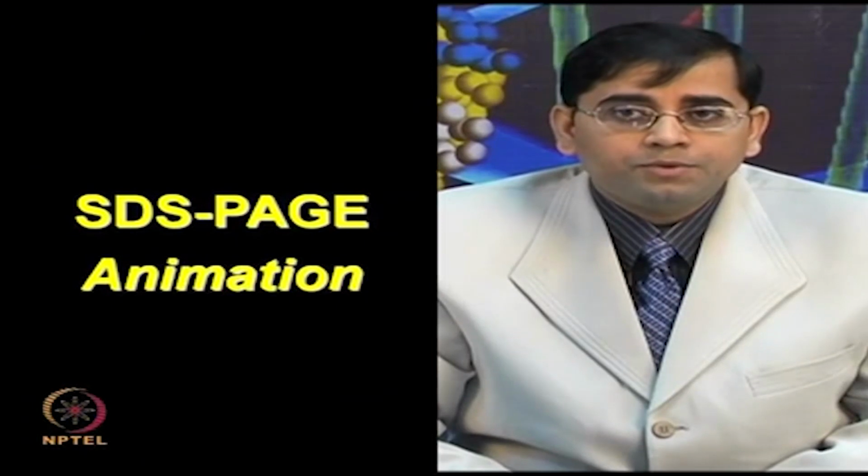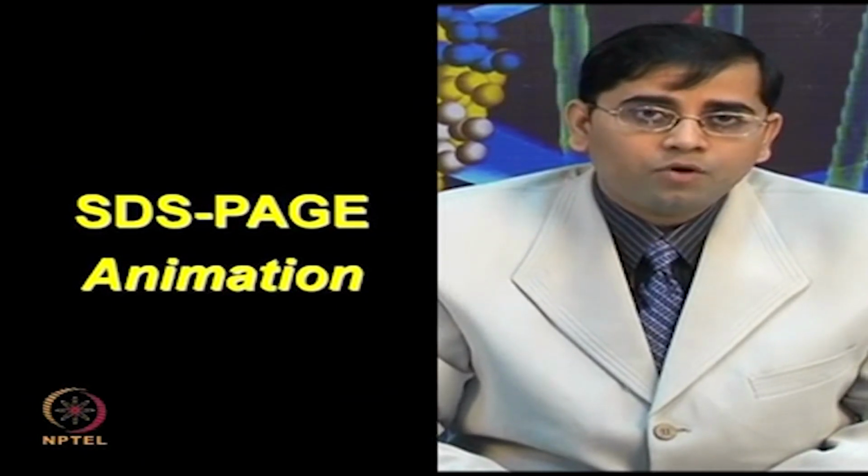Then we have different wells, and in each well, the unknown protein for which you want to determine the molecular weight can be loaded. After staining with Coomassie blue, you can see a pure band here in this case. So, one can determine the molecular weight by performing the SDS page. I will now describe the animation and show you the steps involved in SDS page.